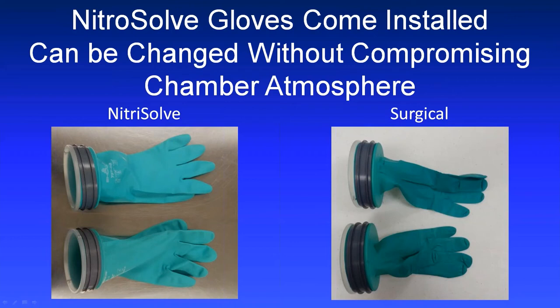But there are pluses and minuses to different glove types, which we'll go through in Unit 6 so that you can make the best choices for what type of gloves you want on there. Now, these gloves can also be changed without compromising the environment in the chamber. And we will show you that technique as well in a later video.